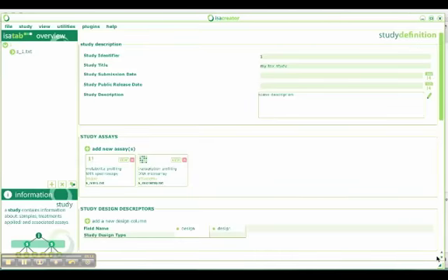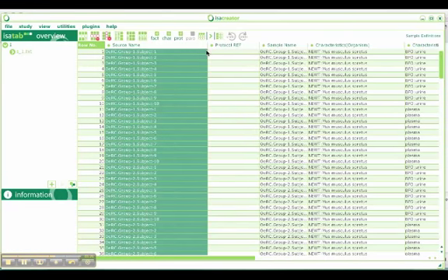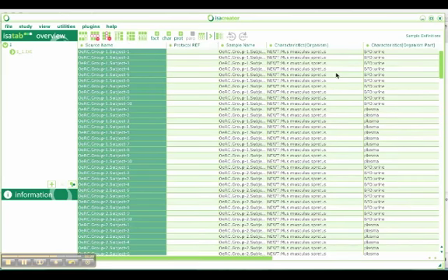Progress is done, and we end up in this place, which is the ISAcreator normal view with all the elements that have been generated with this pattern, with automatically generated identifiers. The annotation here is available for ontology tags with Mus musculus and BFO.